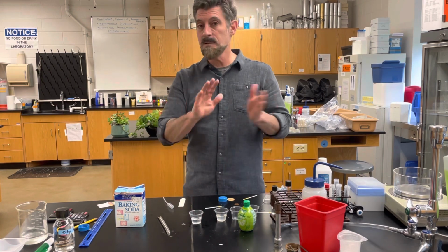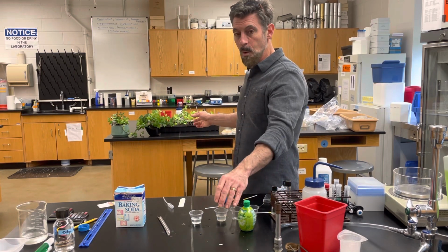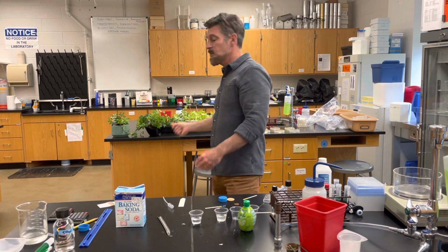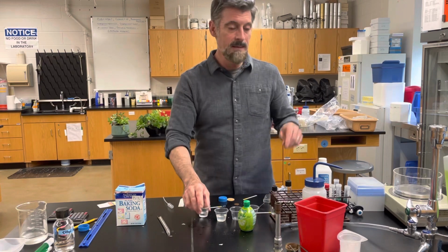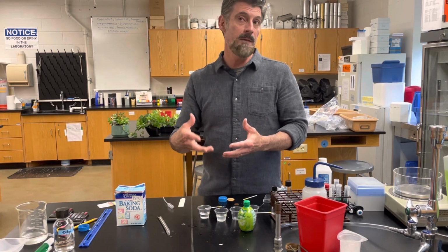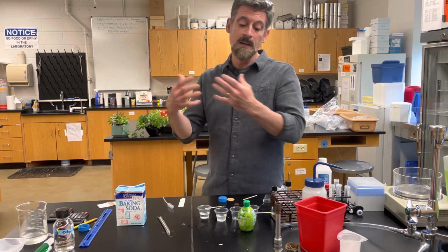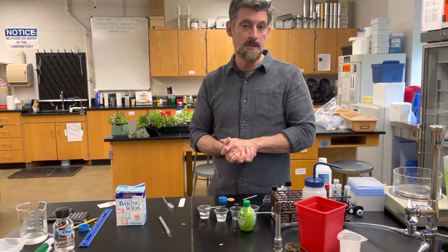This is also, just as a side note, how you would test the soil pH for plants. You would get some water, and then you can test the original pH, take the soil, mix the soil with the water, just kind of the way I did with the baking soda, and then test it again with a new fresh pH strip and see what the resulting pH is. And you can test to find if your soil is more acidic or more basic, using the exact same type of pH test strips as well.